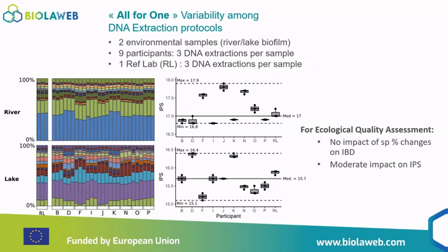In the end, when it comes to producing ecological indices, then it's quite good. Everybody has about the same result. So that was really the idea: that all protocols can be used, and a protocol can be transferred to either advanced or naive participants.